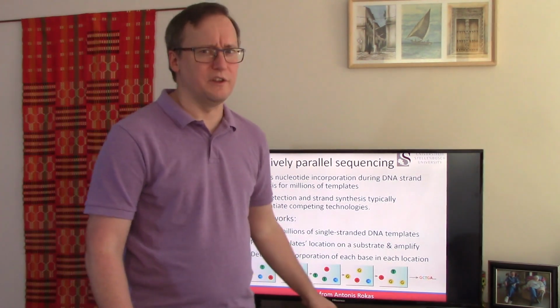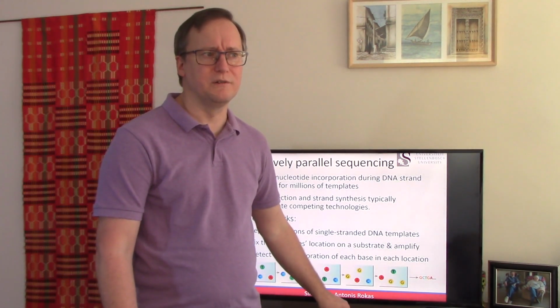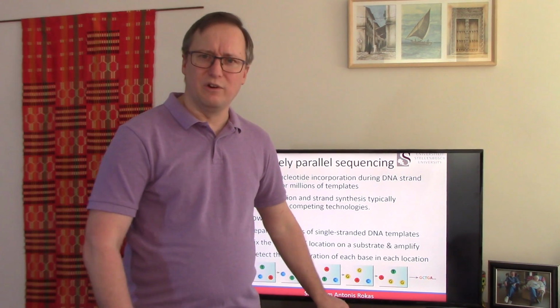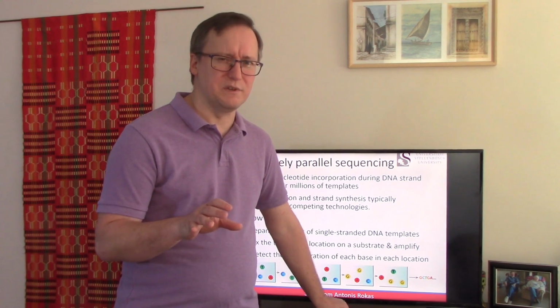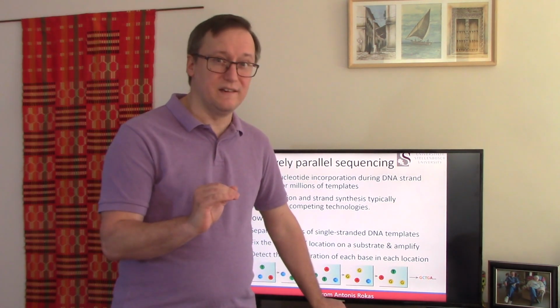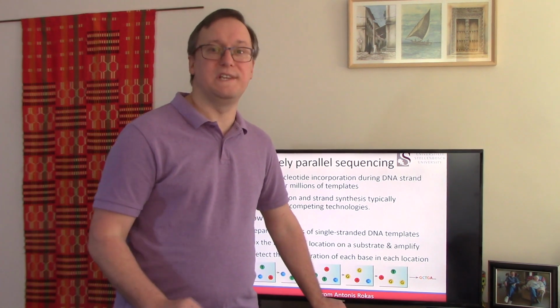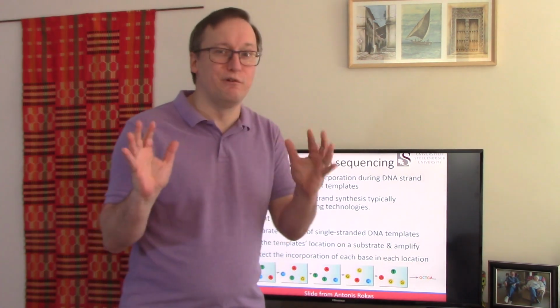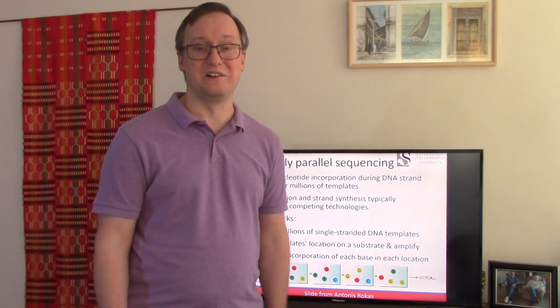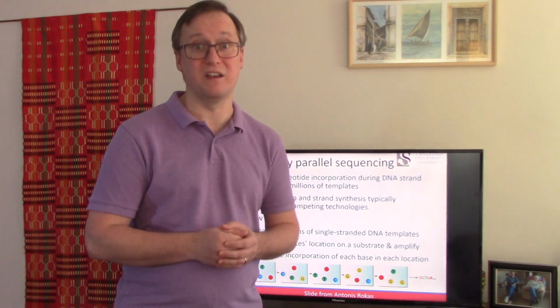Now that's quite different than the way massively parallel sequencing works. Massively parallel sequencing is, generally speaking, going to produce a very different kind of sequence. First off, in the old days, if you had a really top-end Sanger sequencer, you could sequence as many as 384 different template sequences all at the same time. That was considered amazing high-end equipment back then.